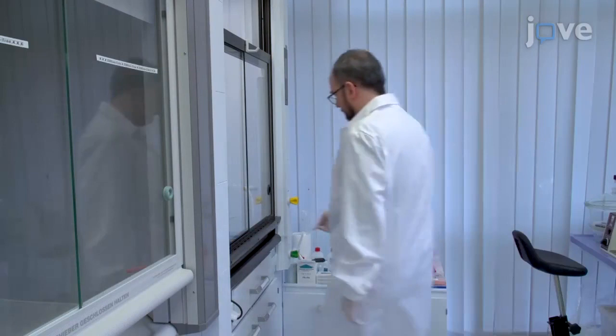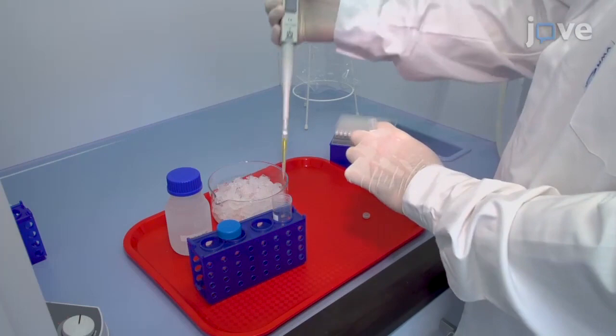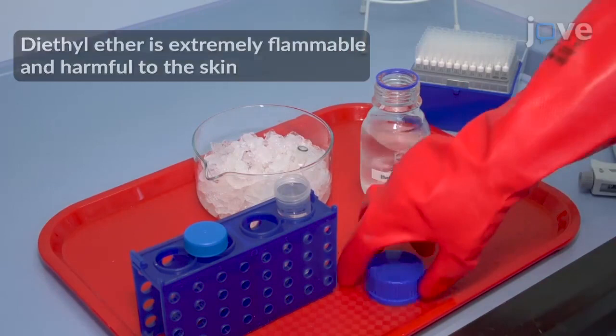To begin delipidation in a fume hood, mix 1-2 milliliters of prepared HDL solution containing 5 milligrams of HDL particles with 50 milliliters of pre-cooled 3-2 mixture of ethanol-diethyl ether in a conical centrifugation tube.